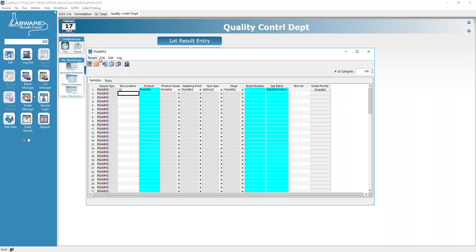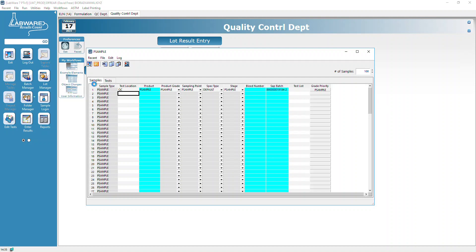At this point, I'm going to say Edit, Propagate Down. This is important. This will take that first record and paste it on all hundred records down.